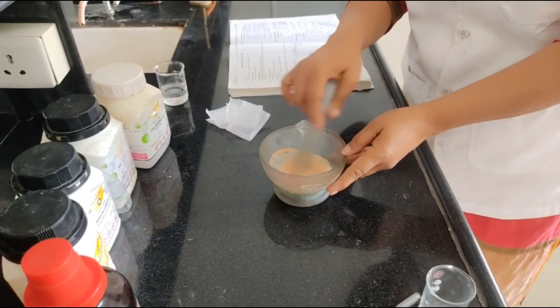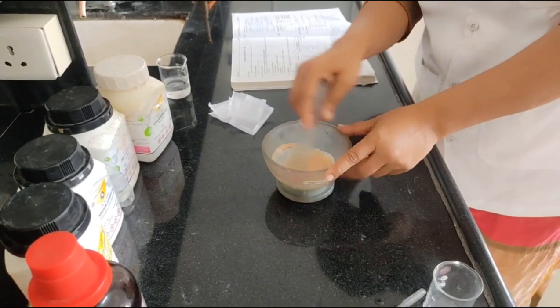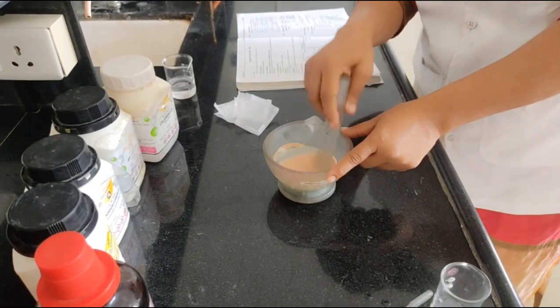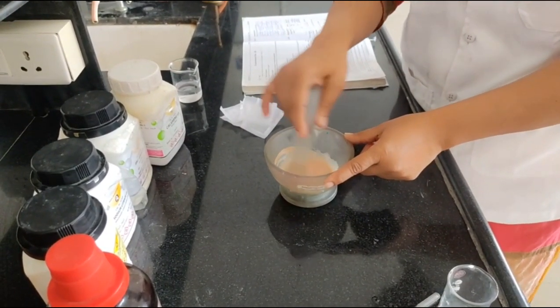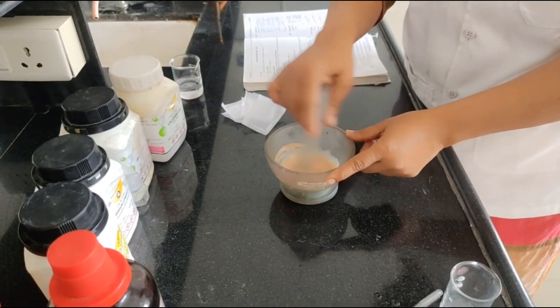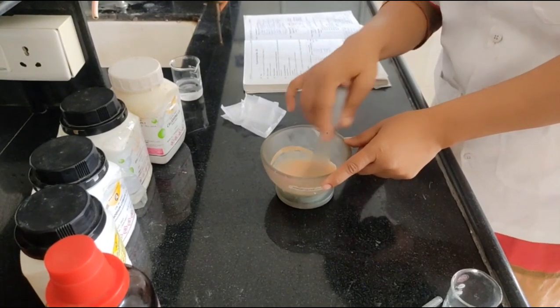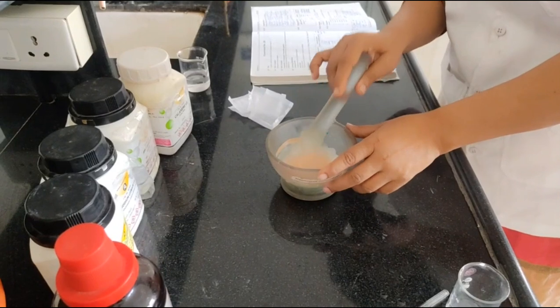Here we can use purified water with a rose flavor as a suitable vehicle, or use perfumes. If you use simple purified water, then we have to add the perfume. But if we use purified water with rose, there is no need of adding the perfume. Our calamine lotion is ready now.